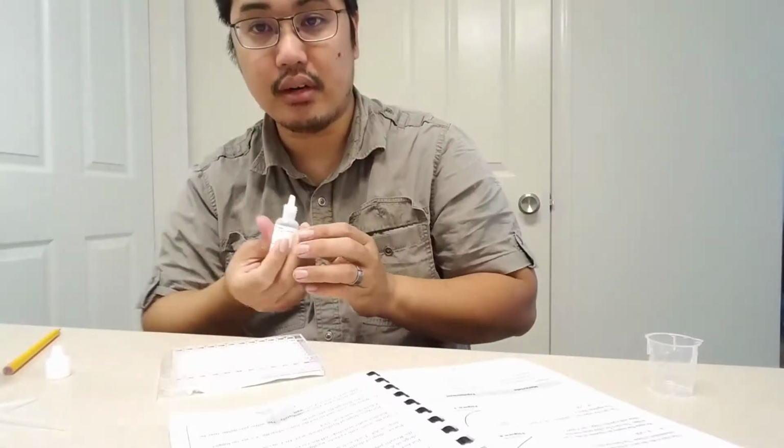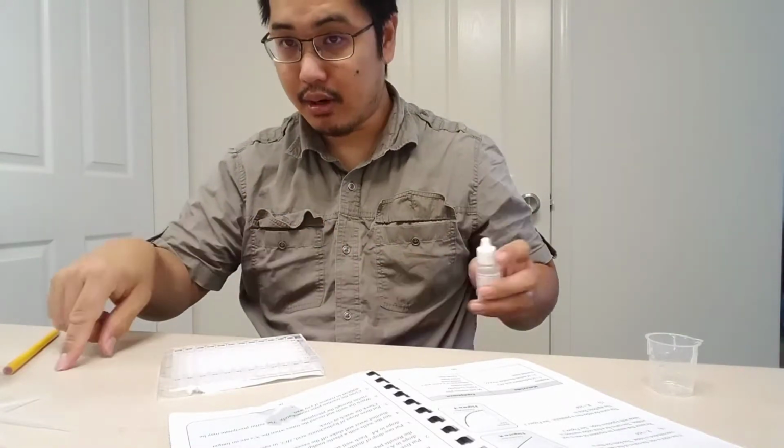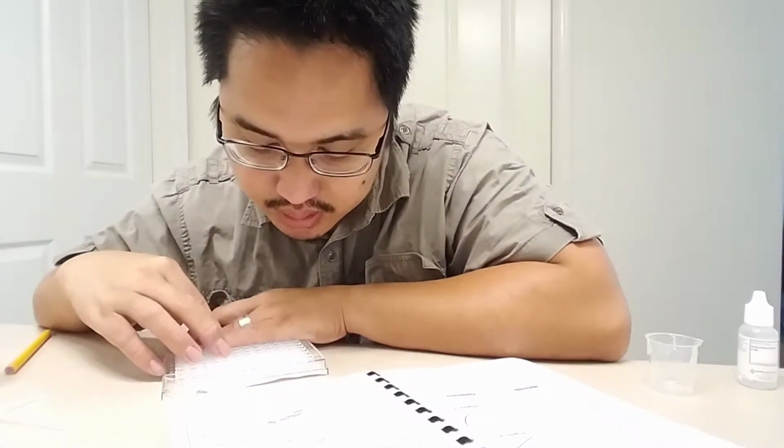What you're going to have, and you're going to need to figure out exactly how you want to do this, is a little stopwatch right here or a cell phone, and you're going to want to click start, and you're just going to watch.